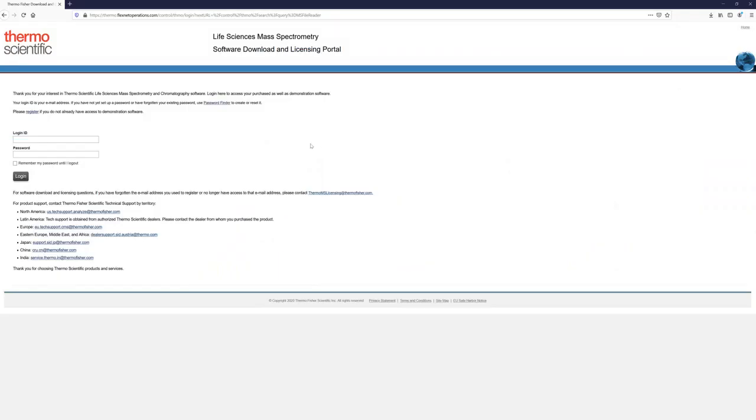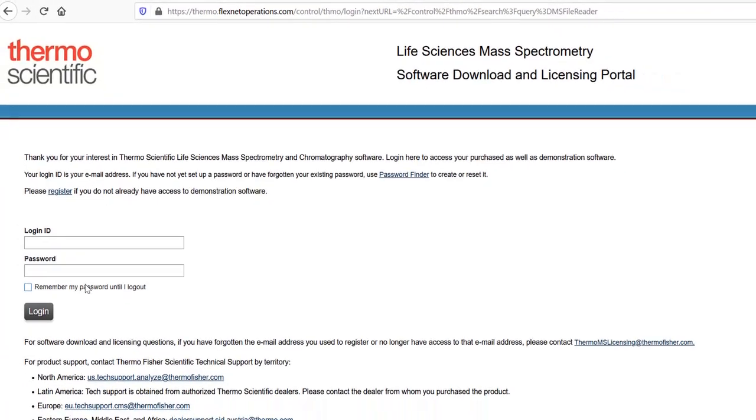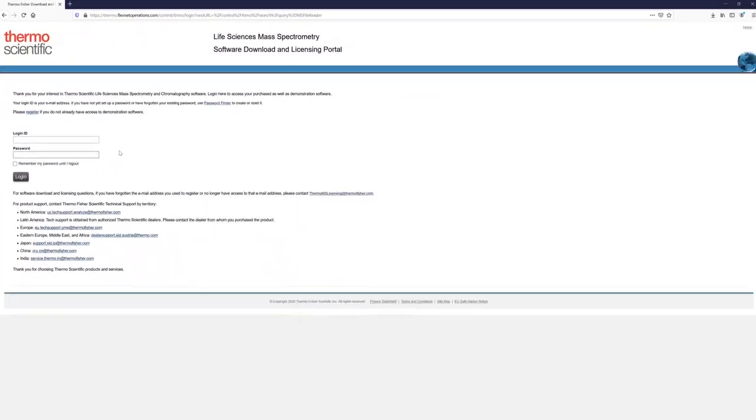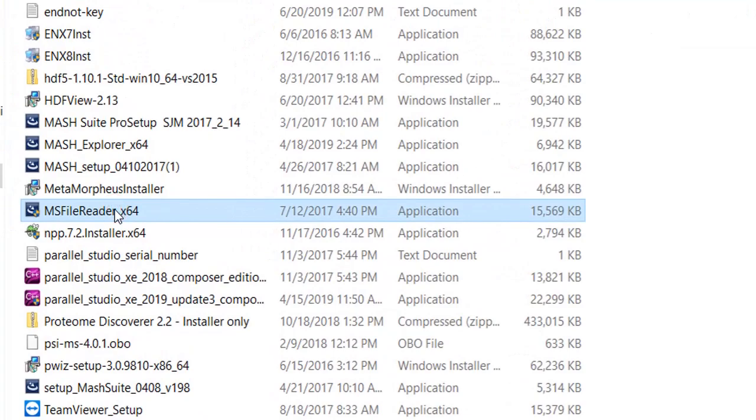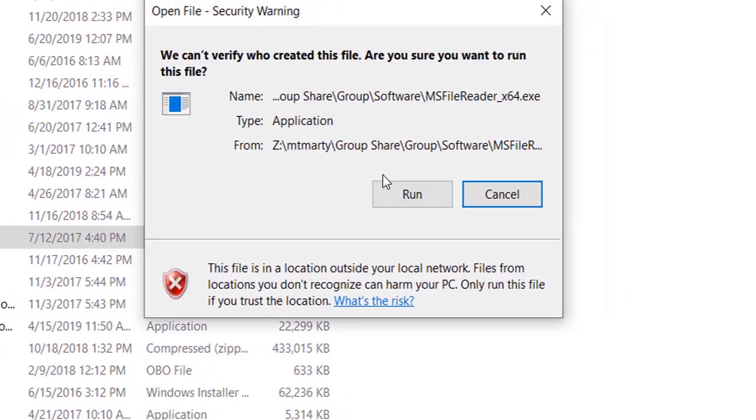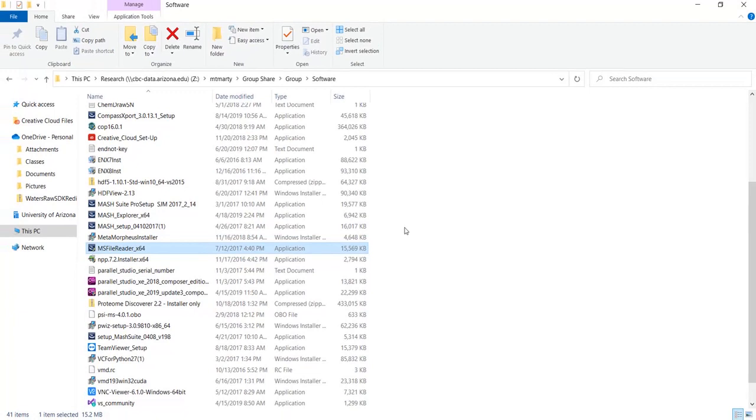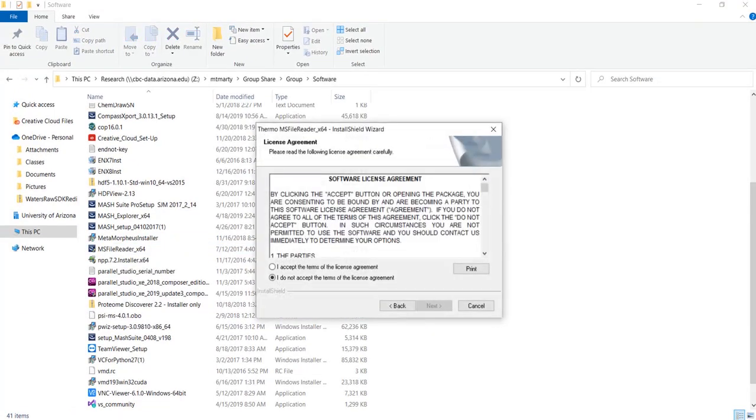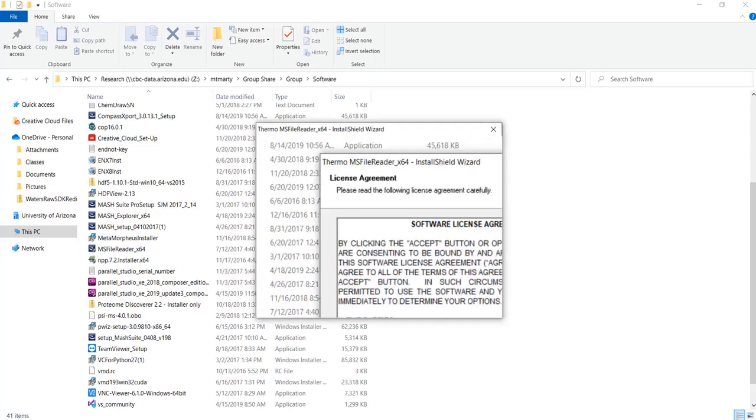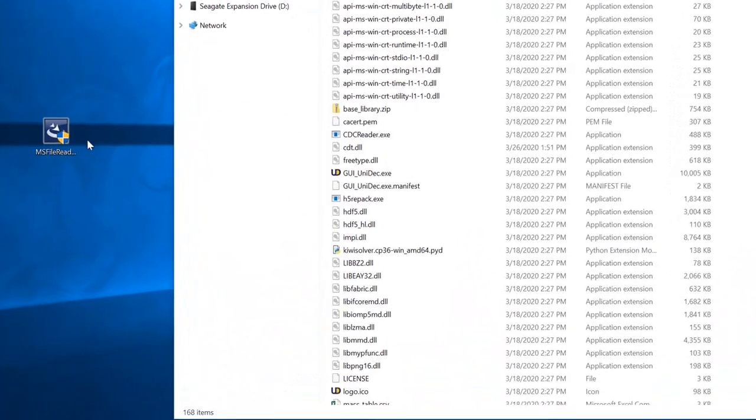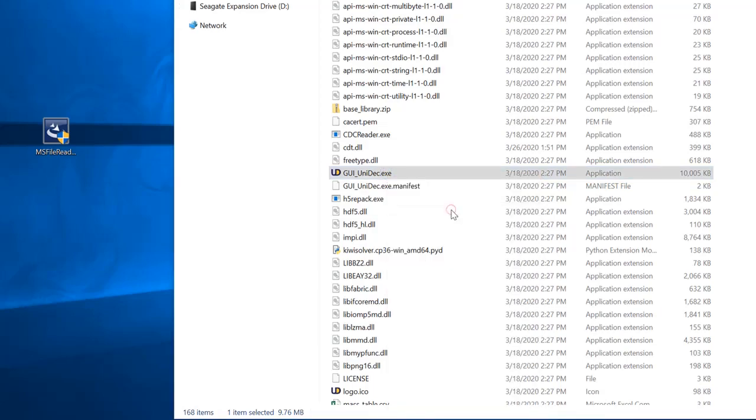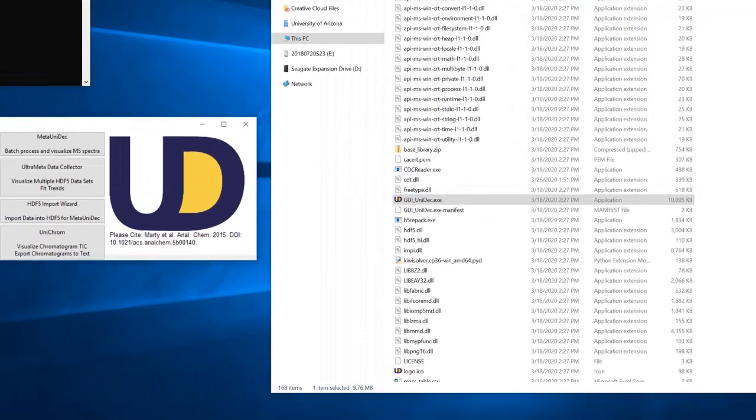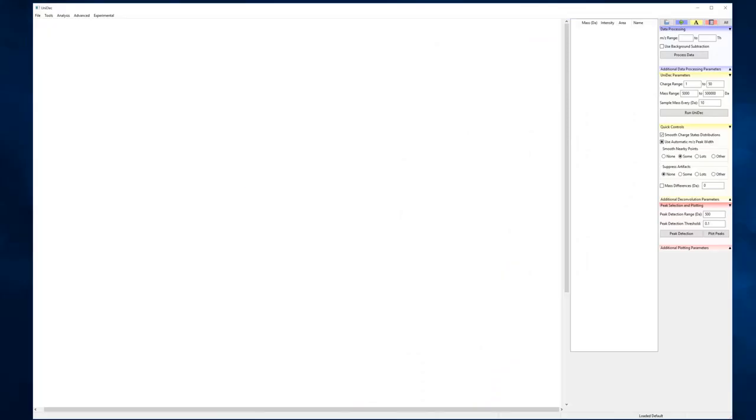You can also load Thermo data natively by installing the MS File Reader program from Thermo. You may need to run GUI Unidec as an administrator to get it to register the MS File Reader, but you should only need to do this once.